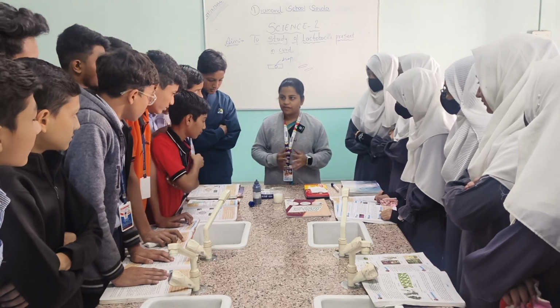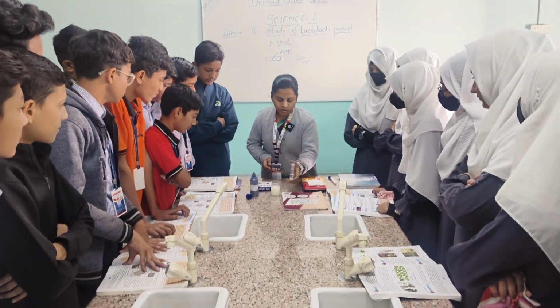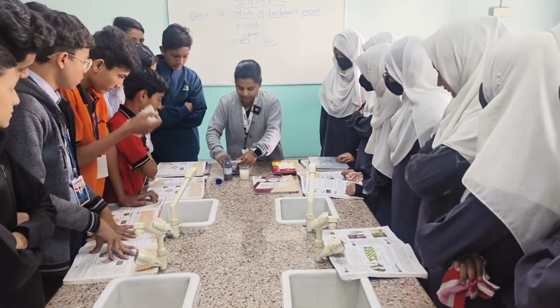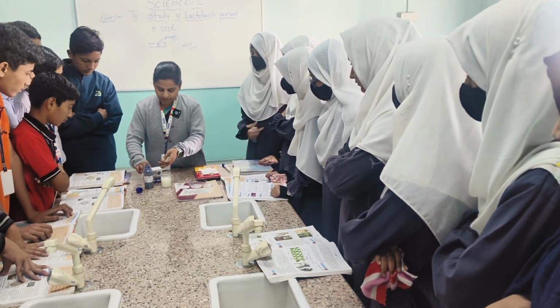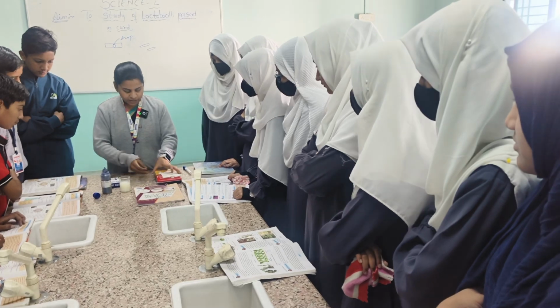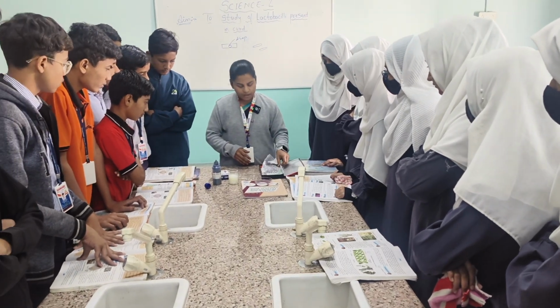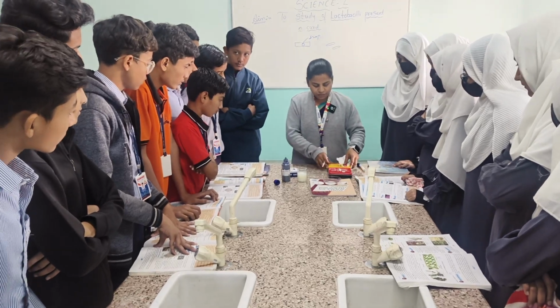As we know, our aim is to study the lactobacilli present in curd. Which things do we need in the practical? We need curd, methylene blue, a glass slide, and a cover slip. And a dropper also. This is a dissection box, and in it all things are ready. From this dissection box, we have to take only the dropper. Let us perform the practical.